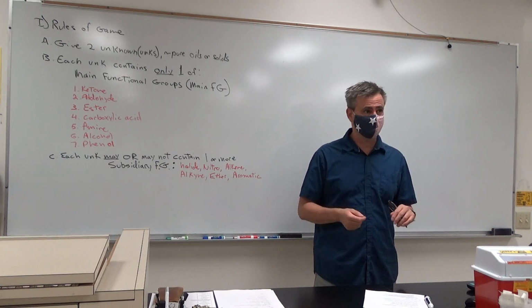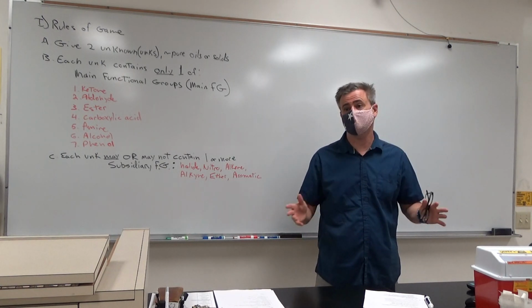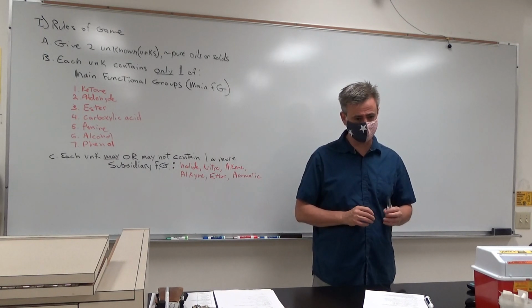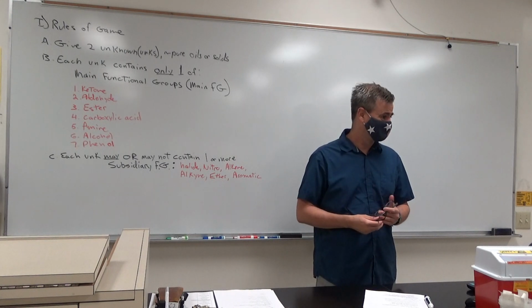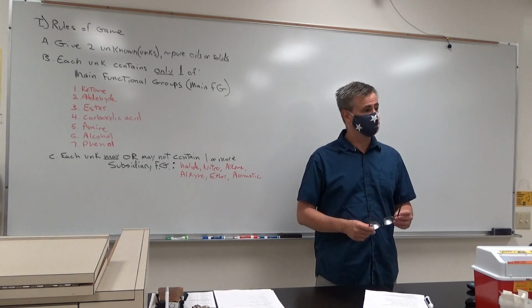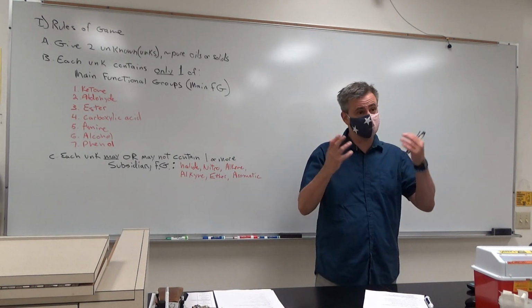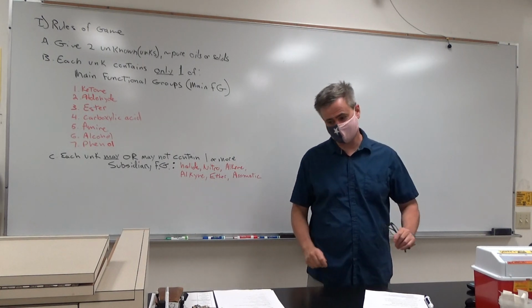Camphor is a white crystalline solid. I'm struggling to think off the top of my head. Eugenol is almost always a clear, slightly yellowish oil. So that's good information. You want to note stuff like that.